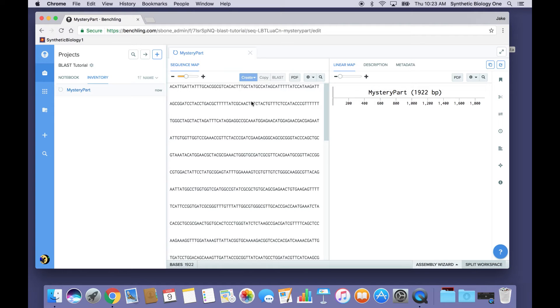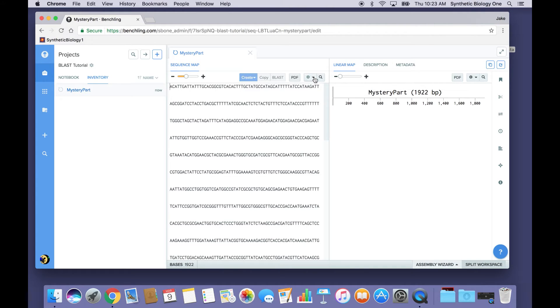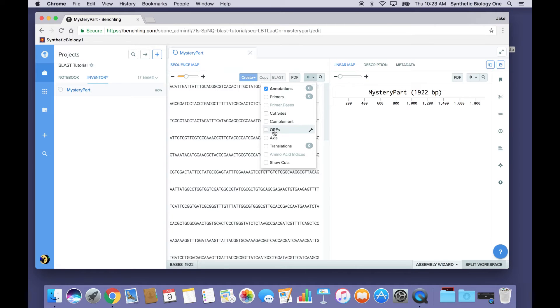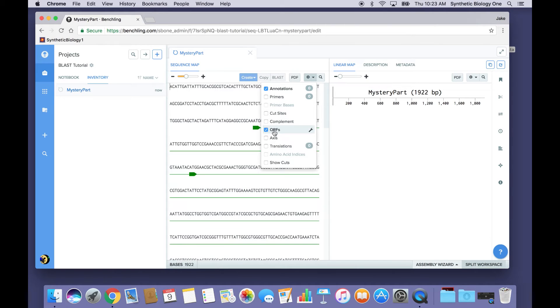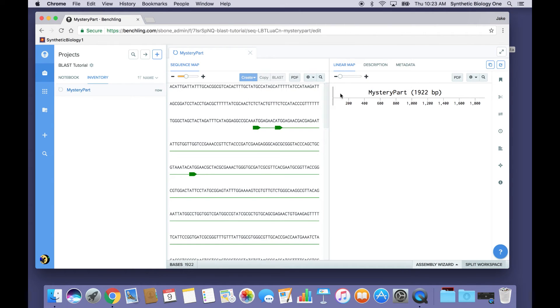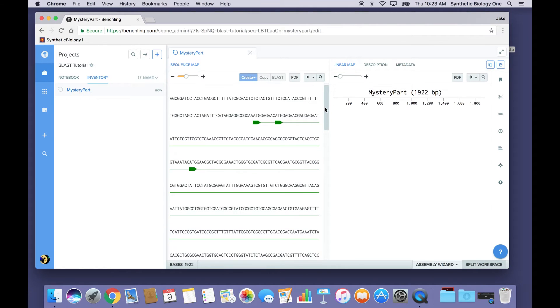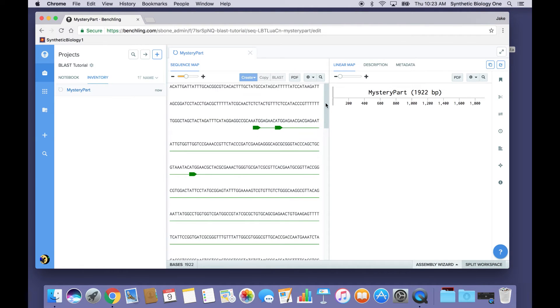So the structure of an open reading frame or an ORF is simple enough that we can detect it automatically using software. So that's what I'm going to do. I can go right here to the Options menu, turn on ORFs, and immediately a bunch of green lines appear as annotations in my DNA Sequence.